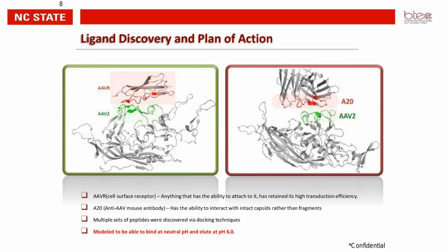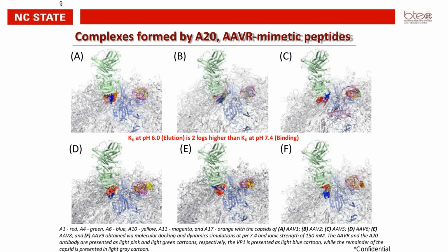purification studies. The other interesting thing was they were all modeled in such a way that they could bind at neutral pH, and also the elution can happen close to neutral pH environment. So these were some of the peptides that we had discovered.